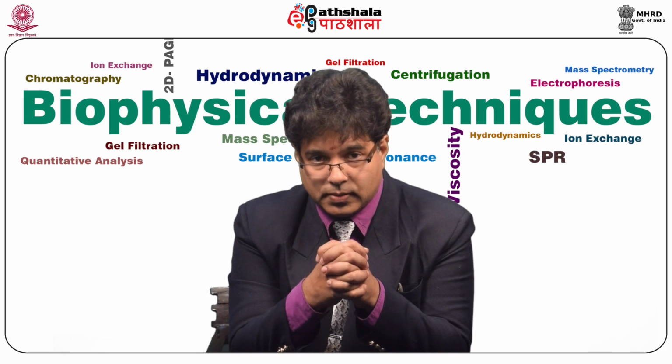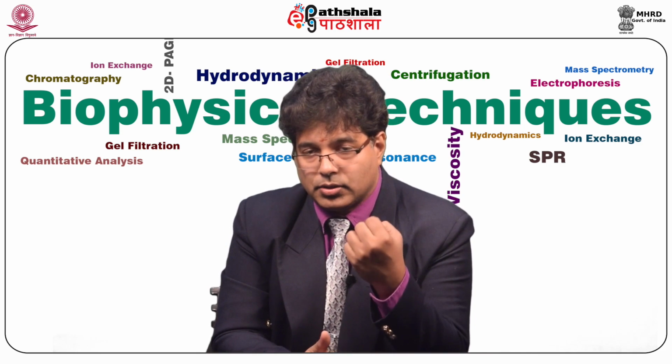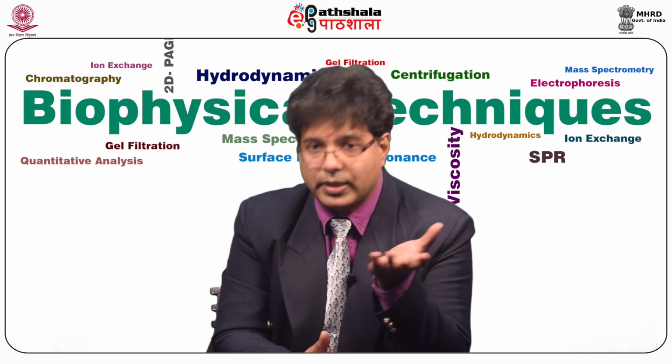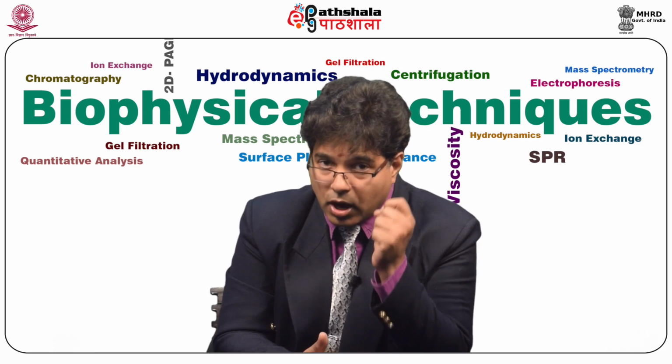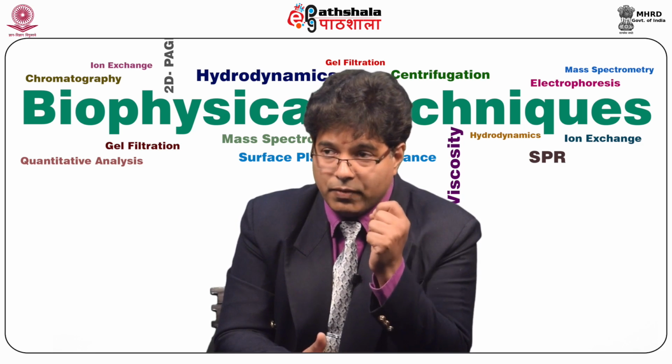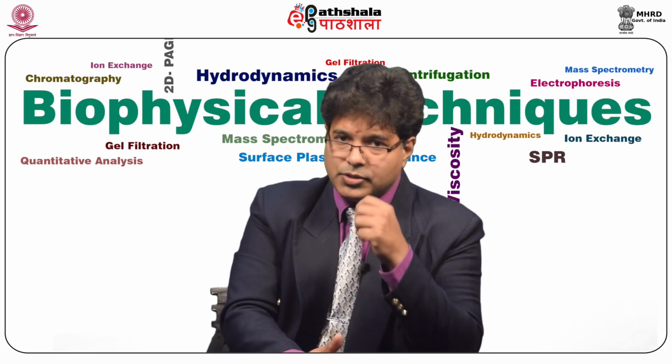When you put that salt in water, it dissociates into plus and minus ions. Now the problem is how do you convert these ions, which are in a liquid state, to the gaseous state, and they should be ionized and charged so that they can flow through this vacuum.